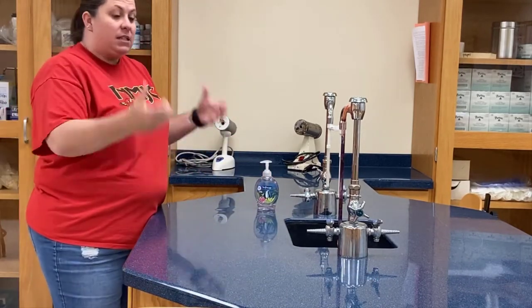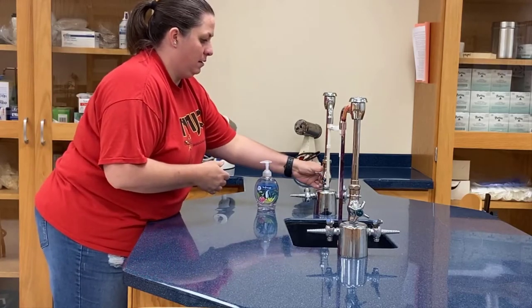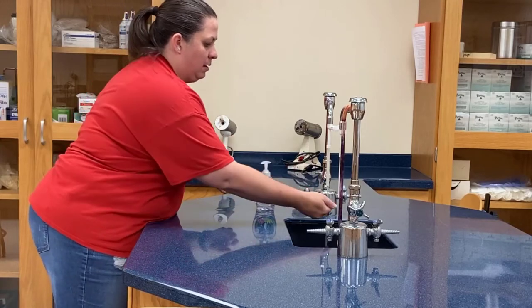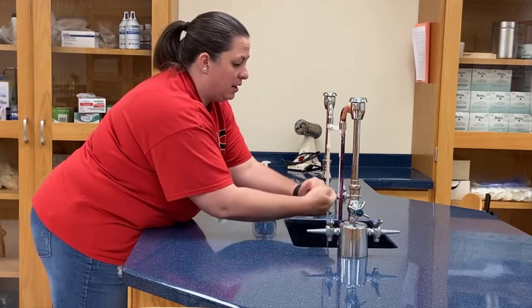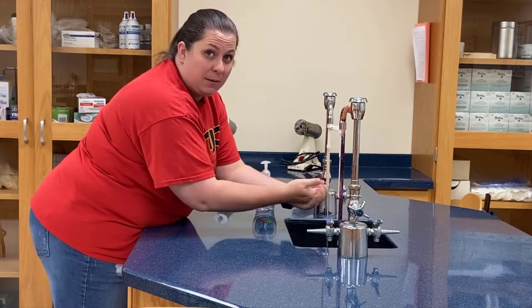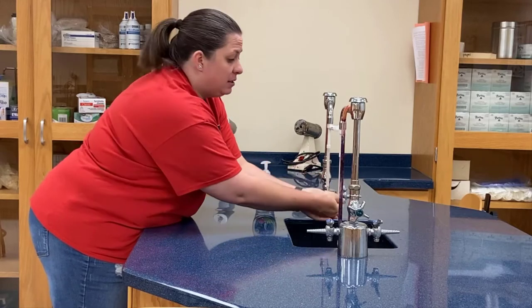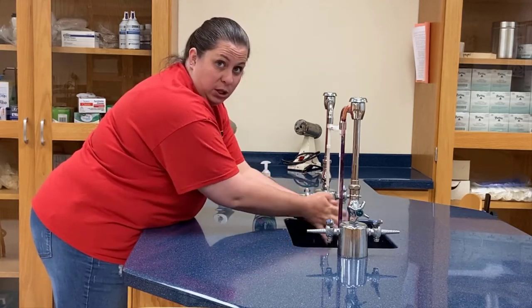Now that our work surface is clean, we need to make sure that we wash our hands. We want to make sure we wash them very well, getting all the surfaces, because what we're going to be working on are aseptic techniques and we don't want to contaminate our lab or our products just because we didn't wash our hands when we were supposed to.